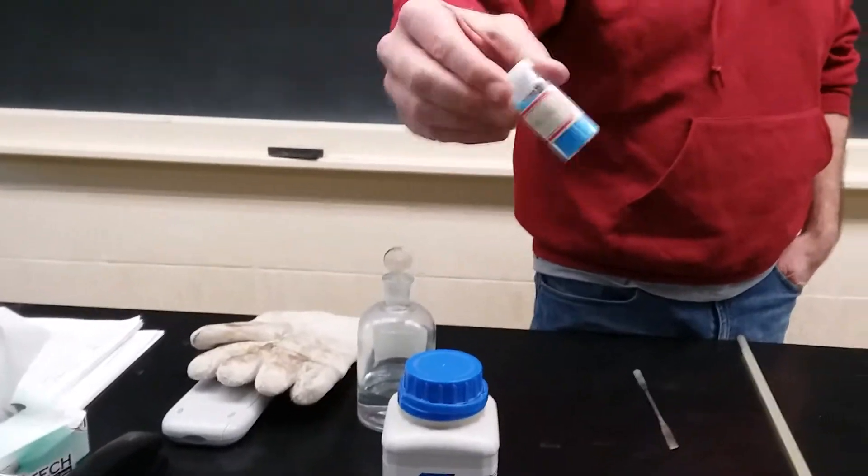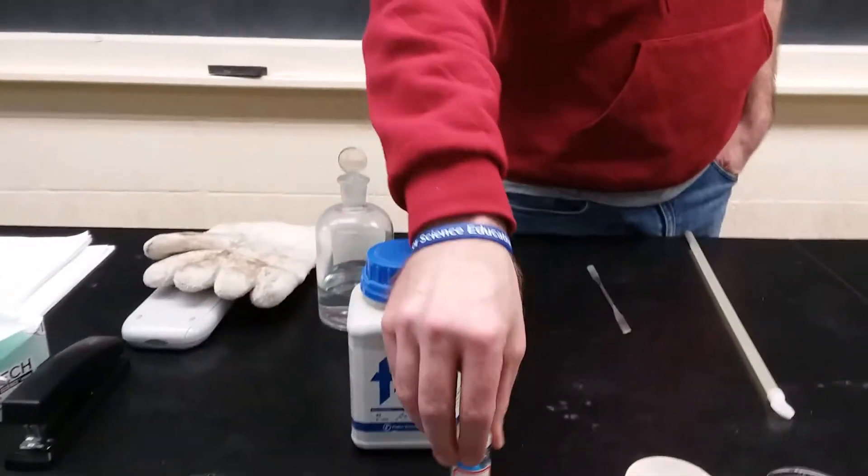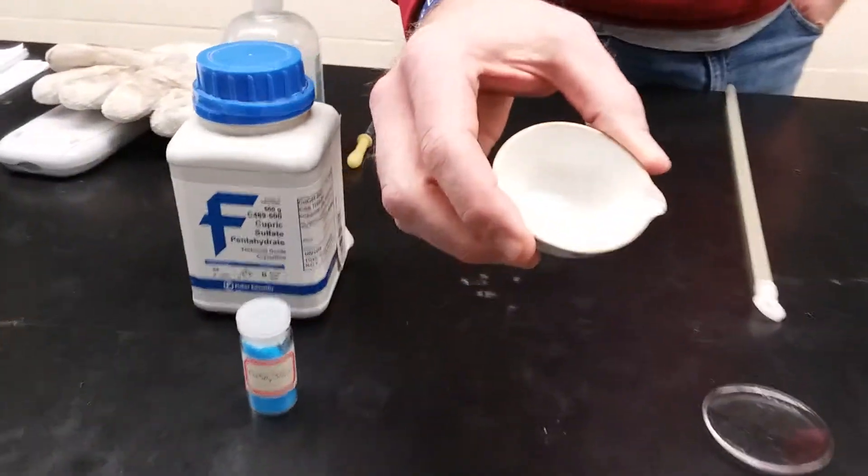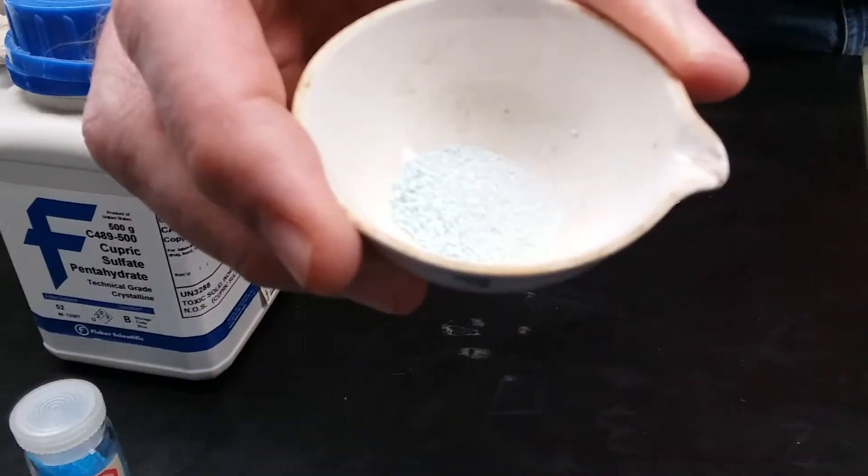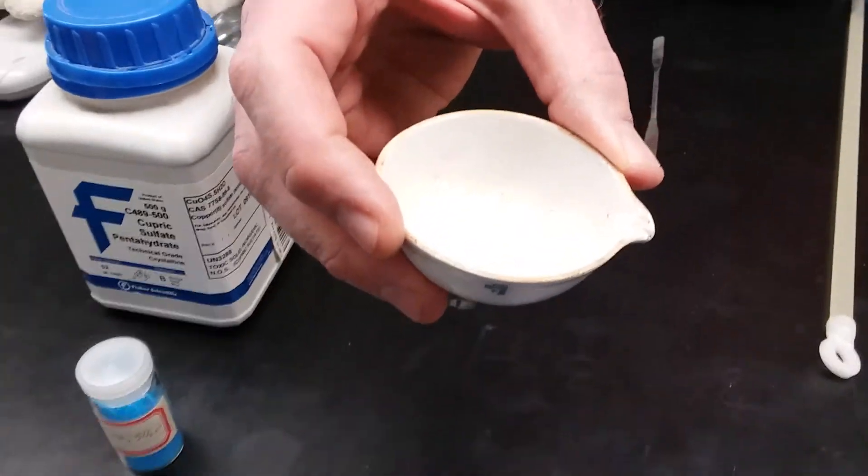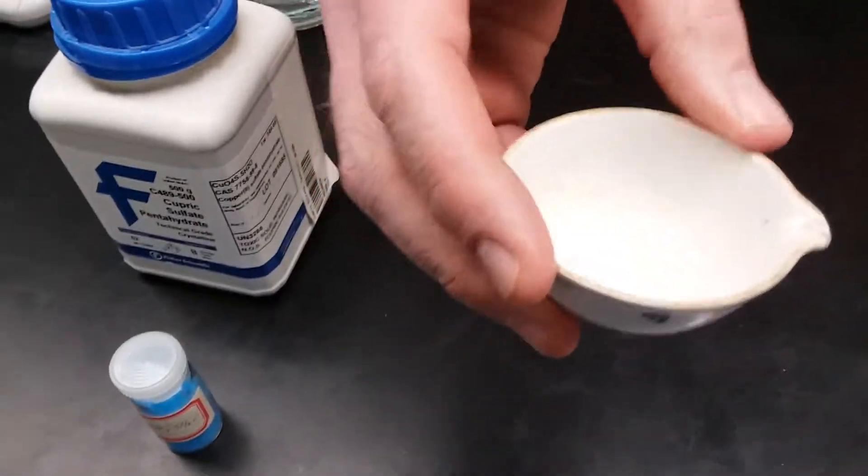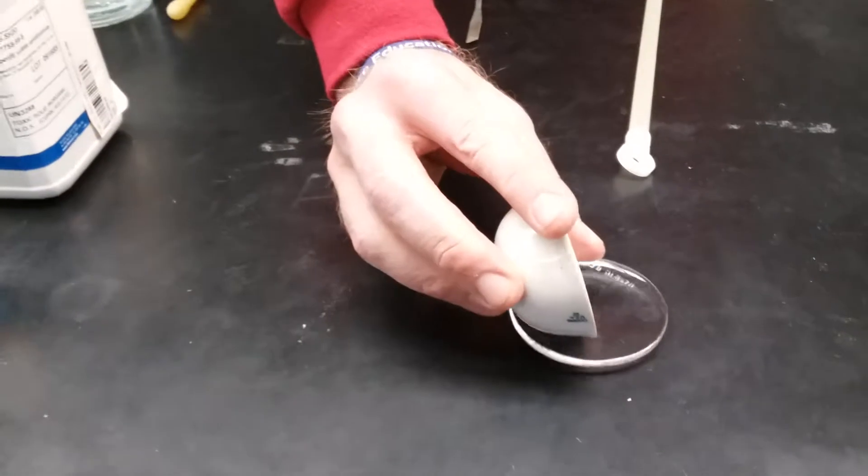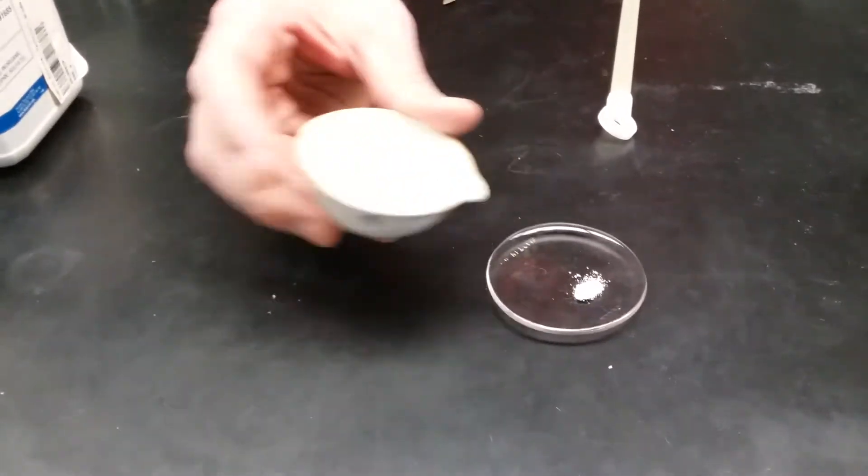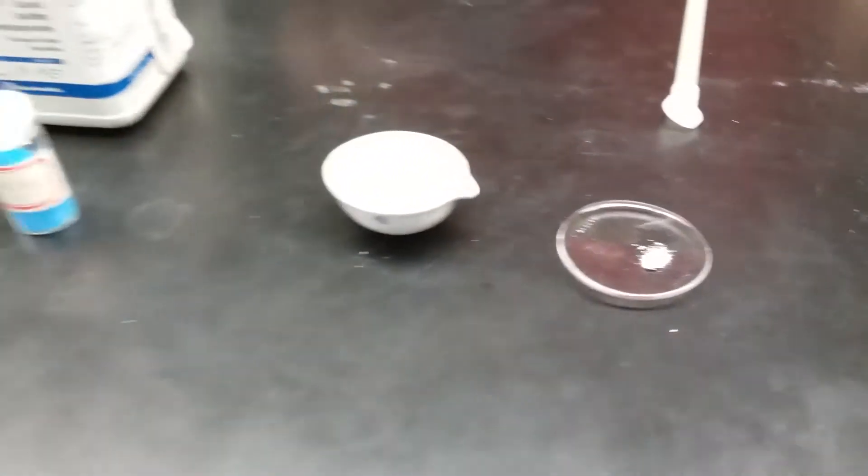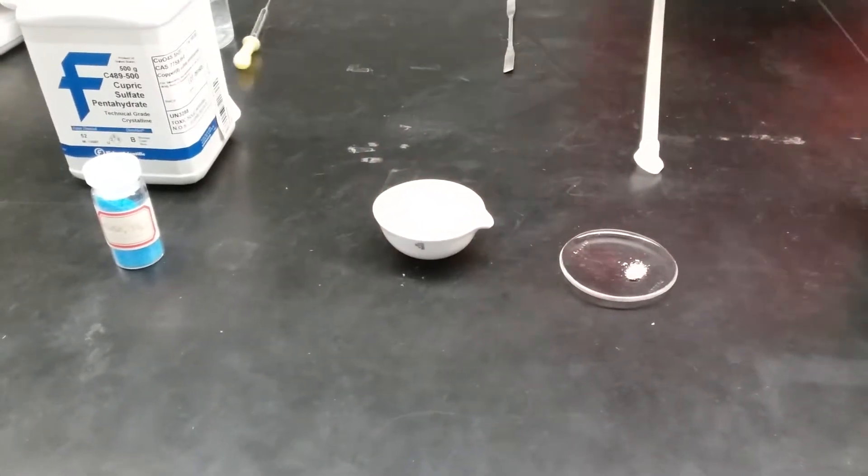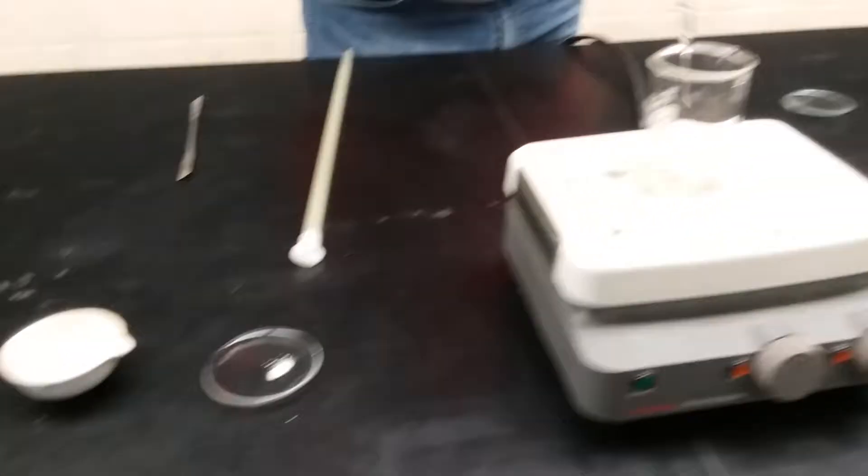So what I did was I took some of this copper sulfate pentahydrate and I heated it on a hot plate, and lo and behold, it gets less blue. I didn't do this entirely, there's still some blue there, but it's kind of white and gray. Today I'm going to put some of this on a watch glass, and then what I'm going to do is add some water to it.